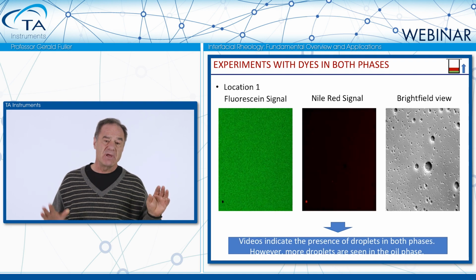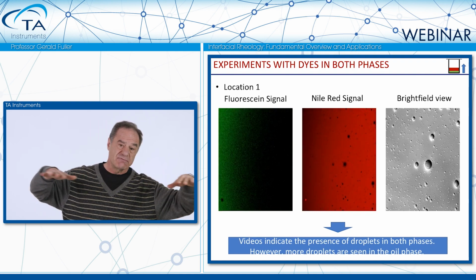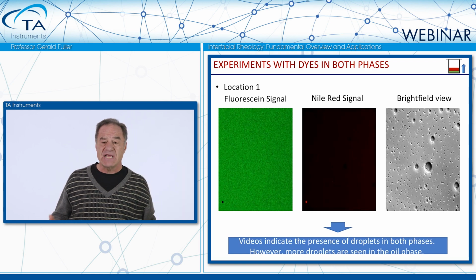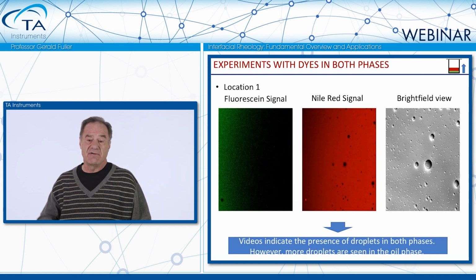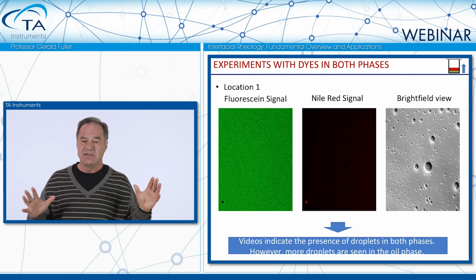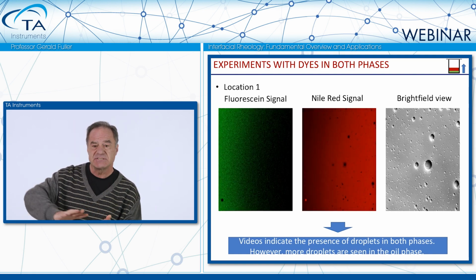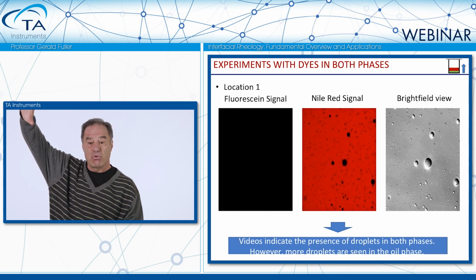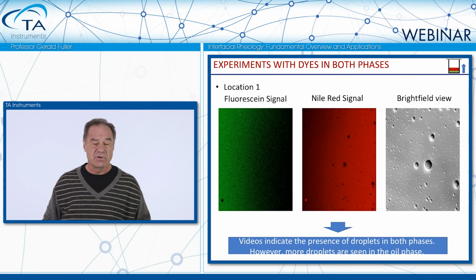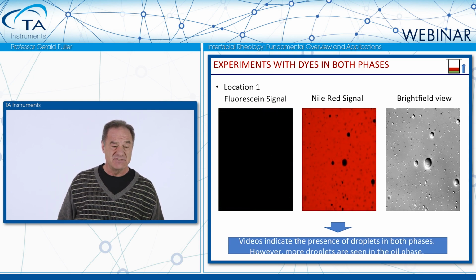So what we're forming are water droplets on the surface of toluene and water, and those act as a de-emulsifier, and that's why you go through the maximum. So you can understand this, but you really need interfacial rheology to understand the initial, very important retardation in coalescence. That's critical to the success of a desalter.